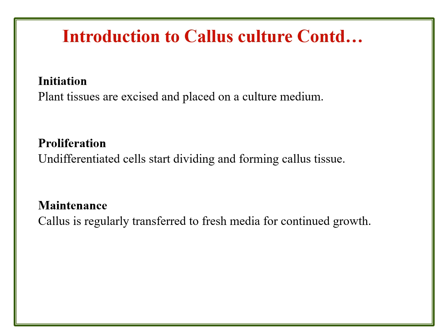of any plant origin, either a plant cell or a tissue or even organs can be placed on the defined medium supplemented with the designed growth hormones, that is auxins to cytokinins, and sometimes gibberellins also play an important role in the sustainability of the culture material on the MS medium.